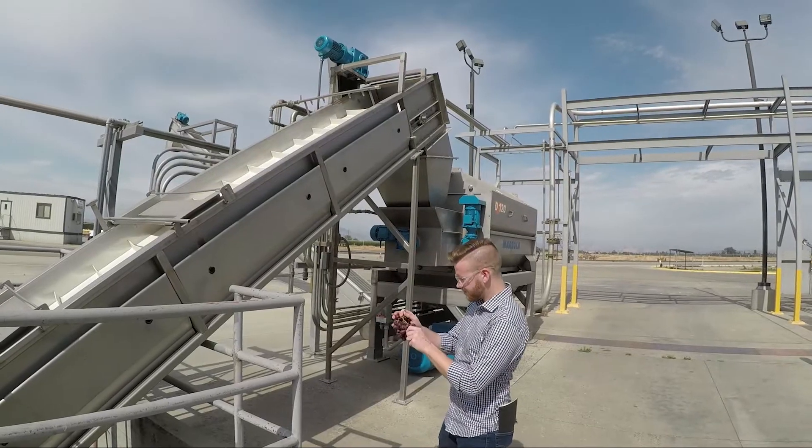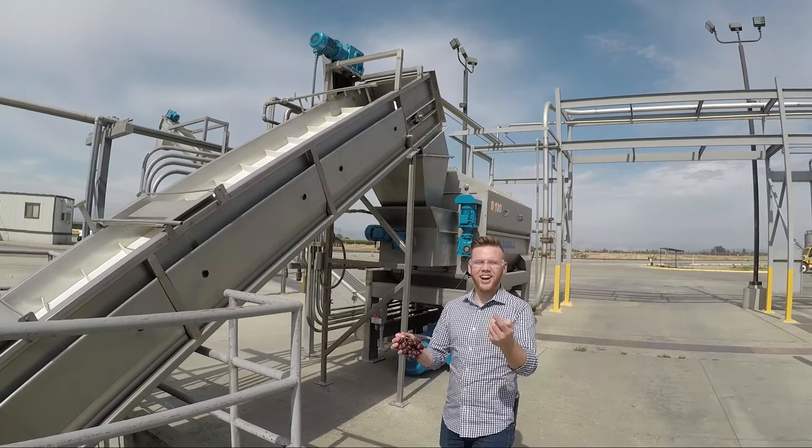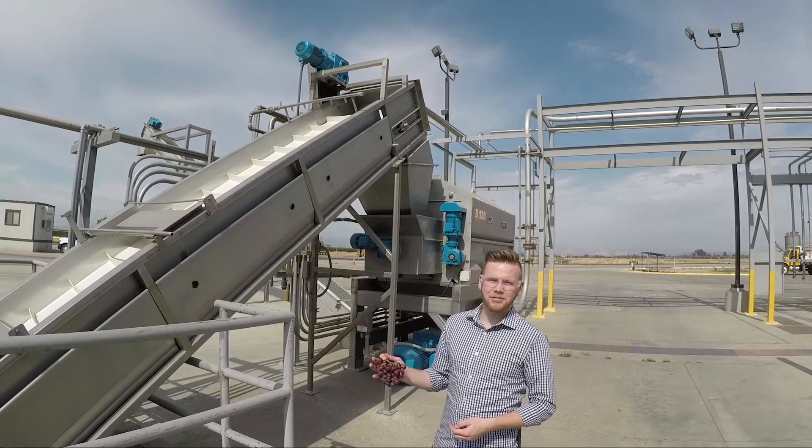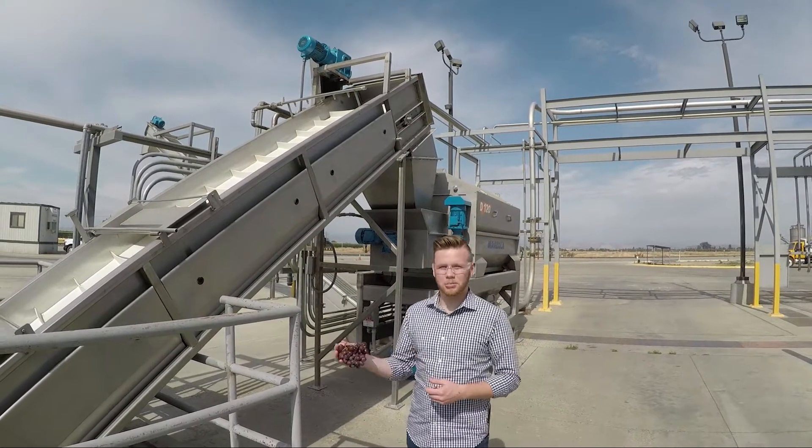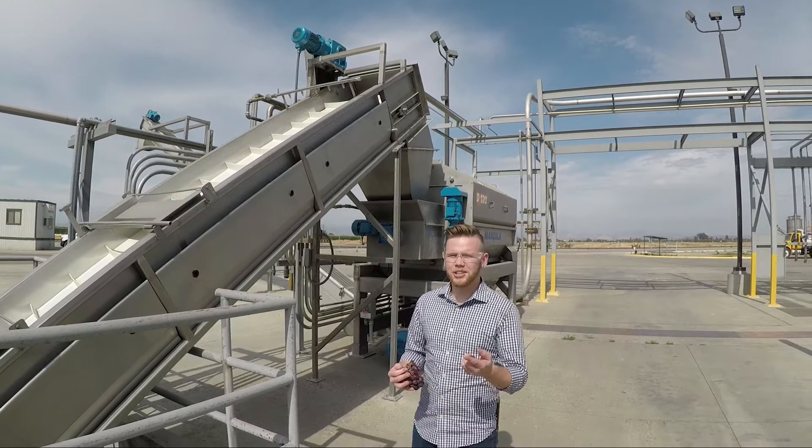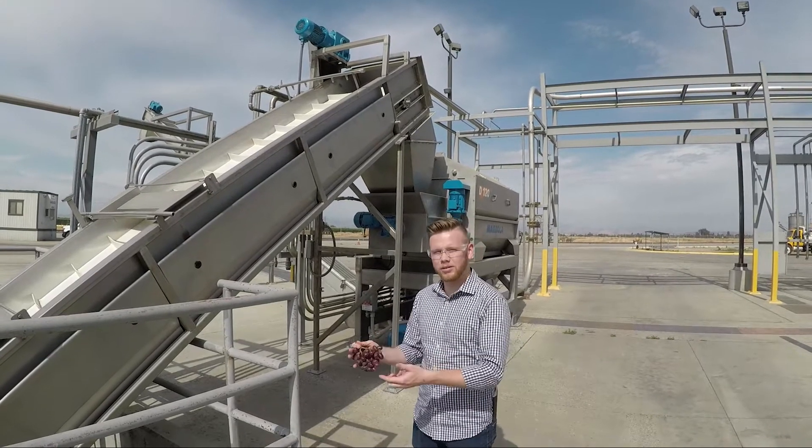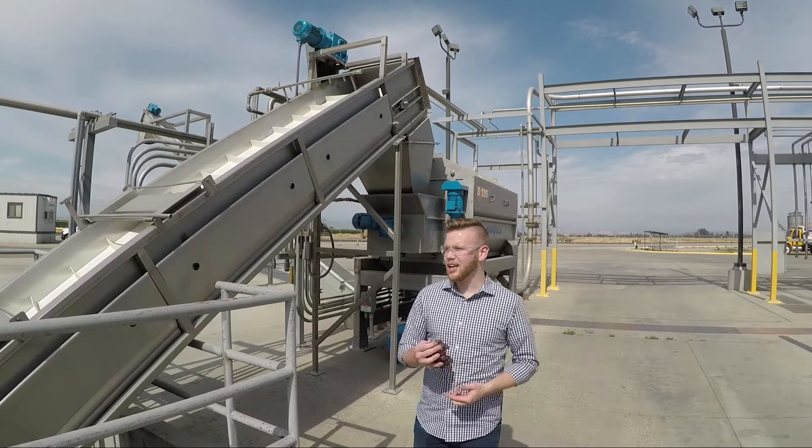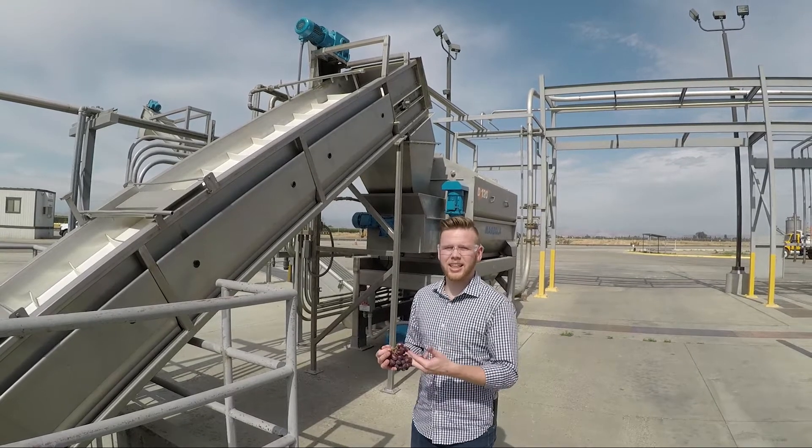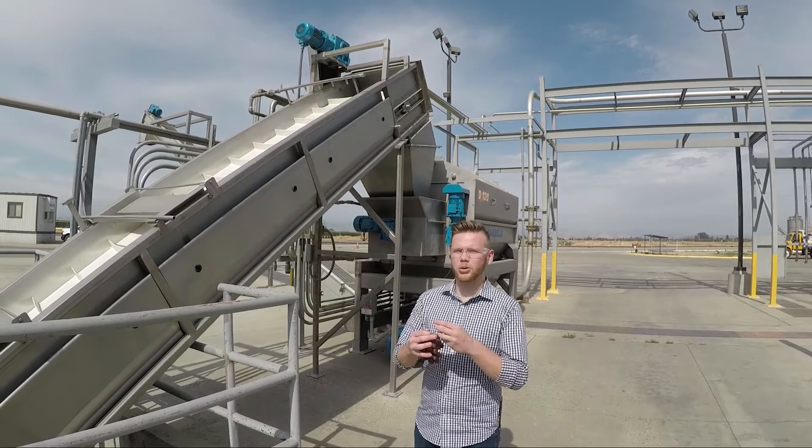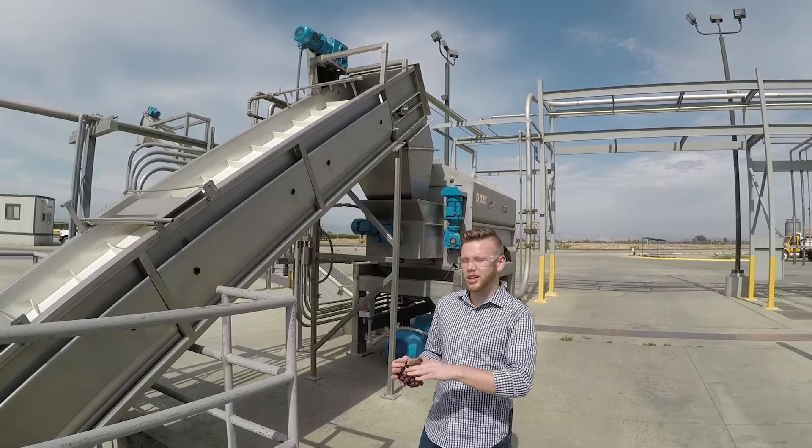Hey Lauren, I thought you were done sampling. Oh hey Adam, yeah I was done sampling in the vineyard but I'm here at the crusher taking truck samples as they enter the winery. Vineyard samples are great for deciding if we want to harvest that block or work with that grower, but the truck sample is actually the last look at that block as it enters the winery. It gives us a great starting point for phenolic potential.